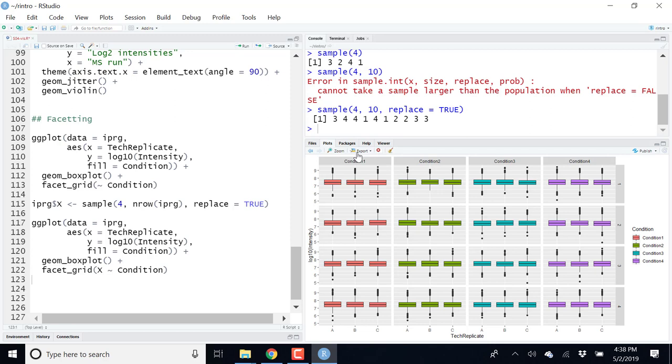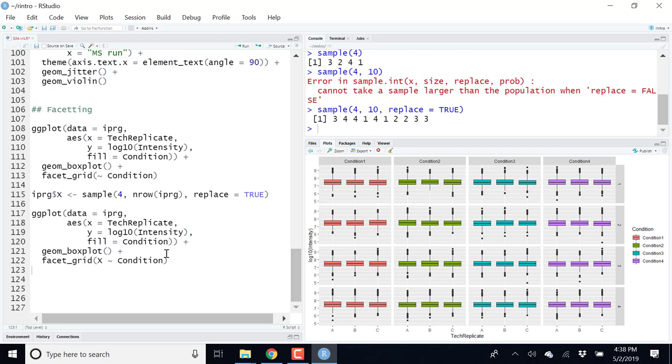But sometimes you can't do it manually in RStudio. For example, if you have 500 genes of interest and you want to produce a figure for each gene, you can't necessarily produce this ggplot2 code 500 times and then click export. So there are R commands to export the figures that we produce immediately to a file, instead of viewing them or displaying them on screen.